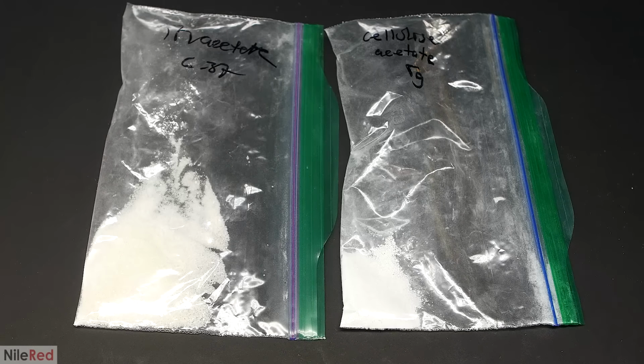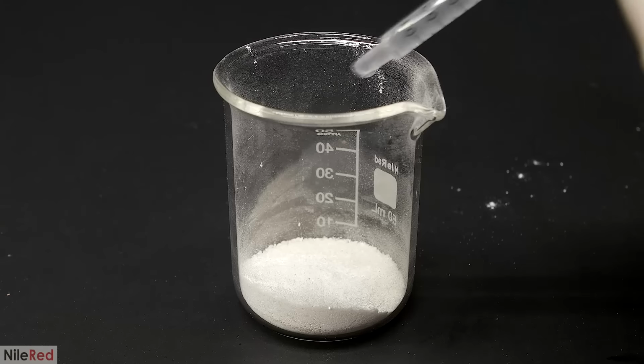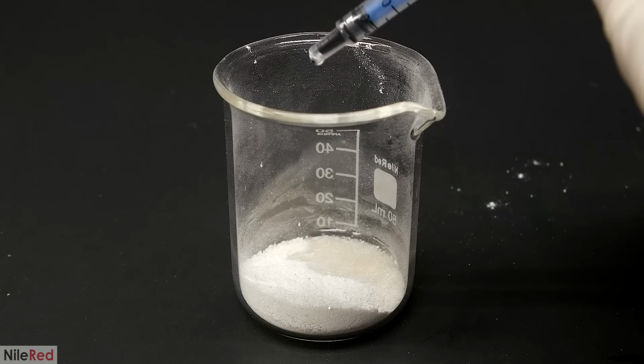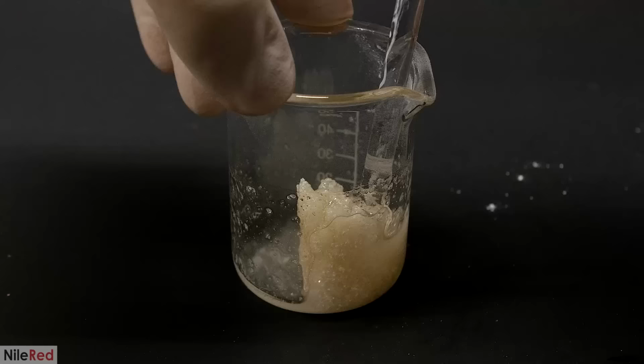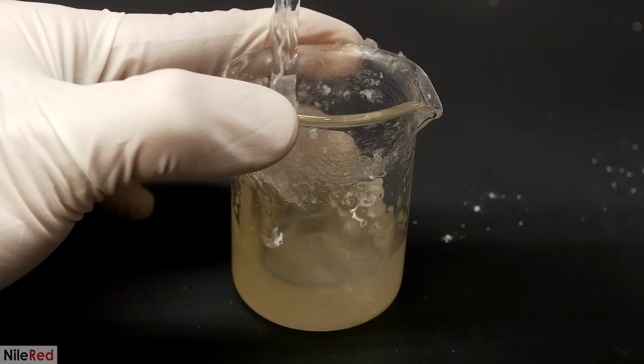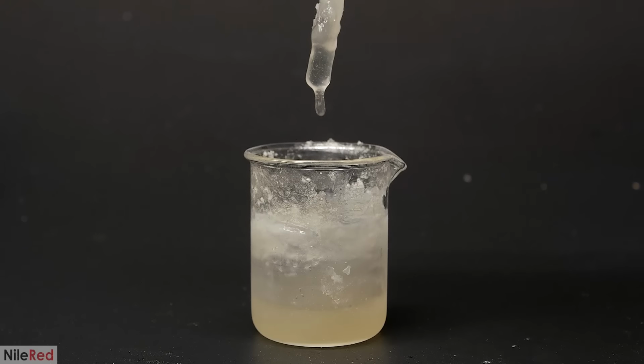I did a bunch of other runs besides the ones that I showed, but they weren't too interesting. With the stuff that remained, I wanted to see if it were possible to dissolve everything and then mold it into something. So I added all of it to a beaker along with the triacetate. Then I added the solvent in small portions until pretty much everything dissolved.